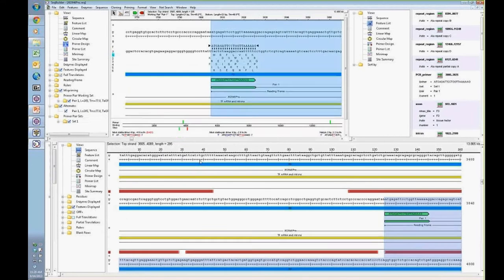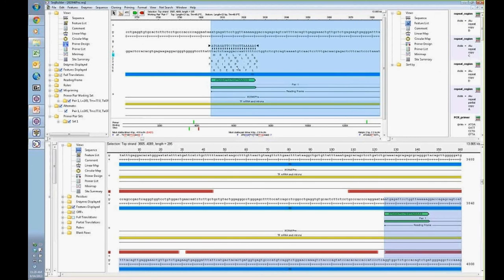So let's click here, OK. When I click OK, in this primer design dialog at the top, there's a number of different palette tools. So this is basically a selection mode, which allows you to click on specific parts of this sequence view, or I can click on a specific part of the primer, and if I want to make a degeneracy, you can do so. So I could simply click C here, and it would change that A to a C.